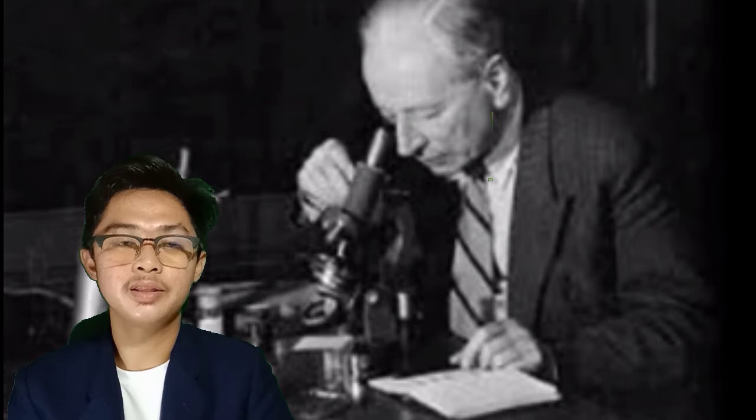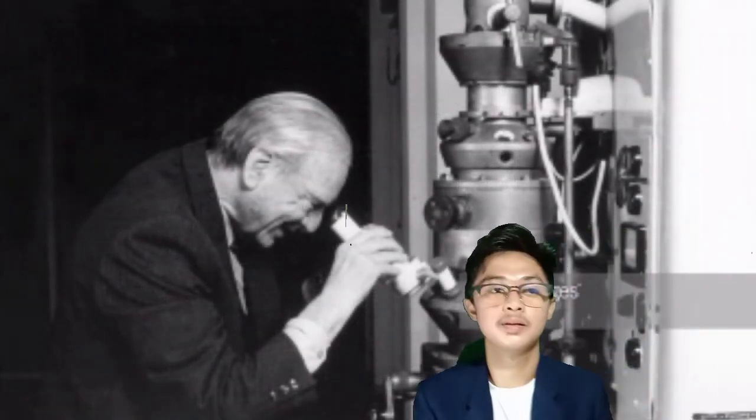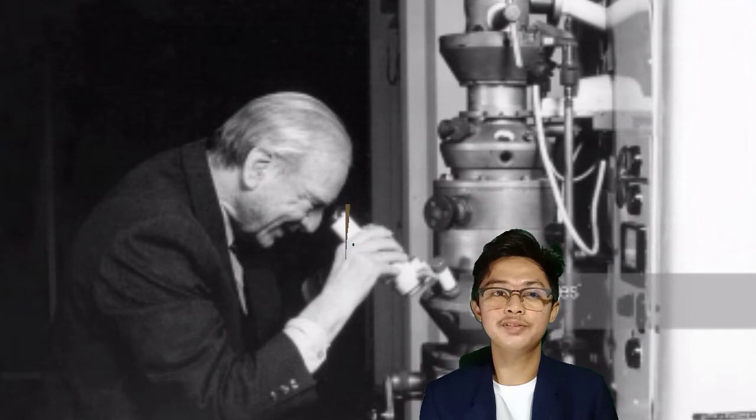In 1932, transparent biological materials were studied for the first time using Fritz Zernike's invention of the phase contrast microscope. Just six years after the invention of the phase contrast microscope came the electron microscope. It was developed by Ernst Ruska, who realized that using electrons in microscopy enhanced resolution.